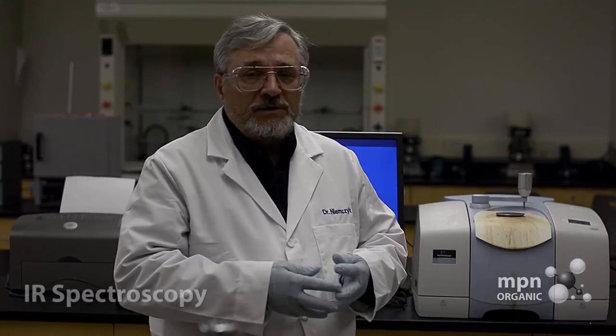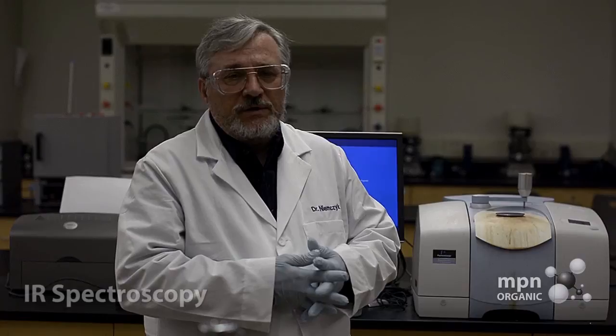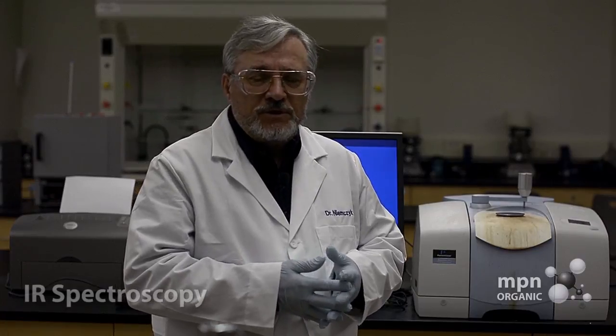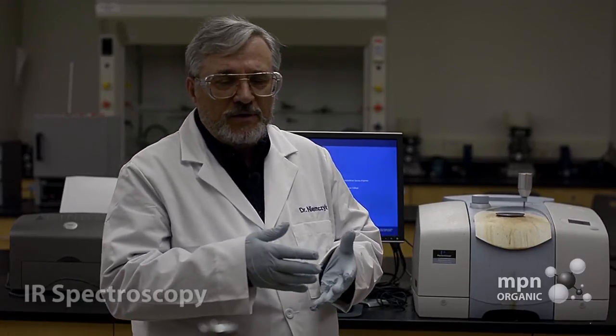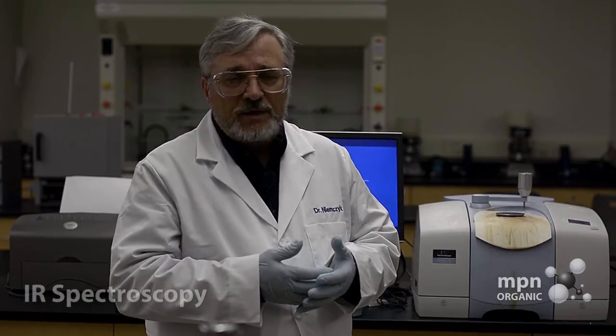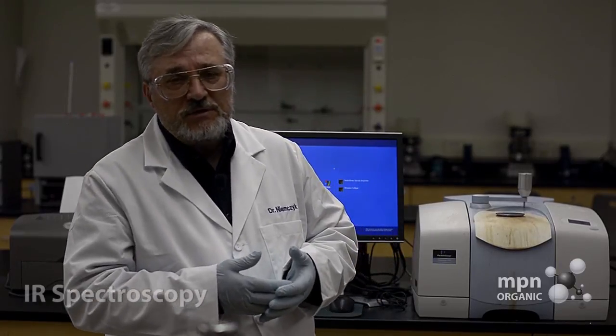IR spectroscopy, or simply IR, is a term that we use for the technique of determining functional groups in a molecule. Functional groups like ethers, alcohols, ketones, aldehydes, carboxylic acids, amines, that sort of thing.